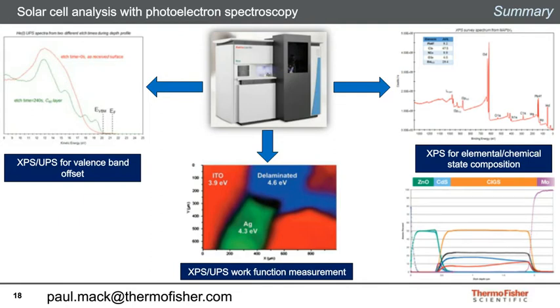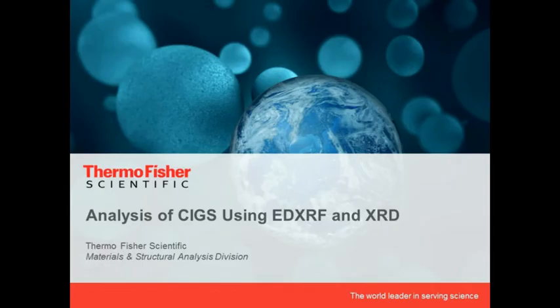Thank you, Paul, for the nice introduction. Welcome everyone to the second part of this webinar. And now we will focus on two other X-ray related techniques. One of them is X-ray diffraction, the other one is X-ray fluorescence spectroscopy.